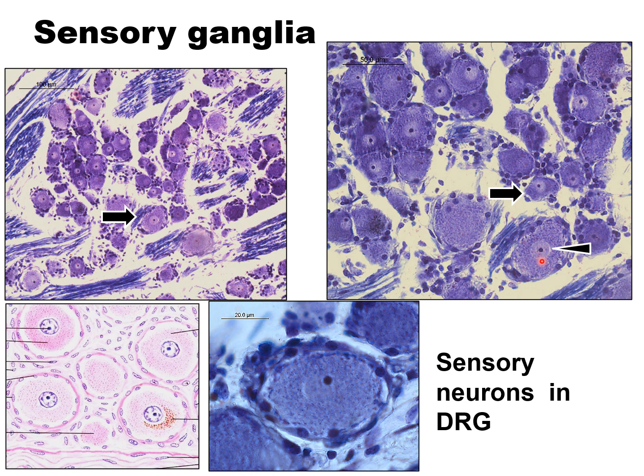You know that dorsal root ganglia cells are pseudounipolar cells. So the dendrite comes from one pole. That is how, if you take a section of the neuron, it looks round. And the surrounding cells are the satellite cells, or the supporting cells.